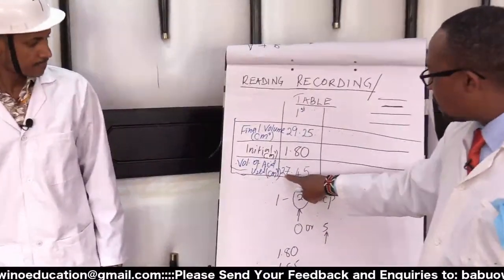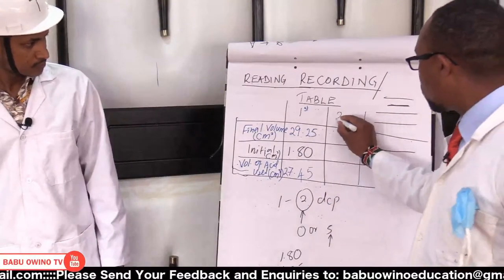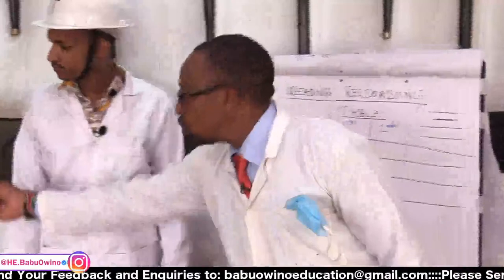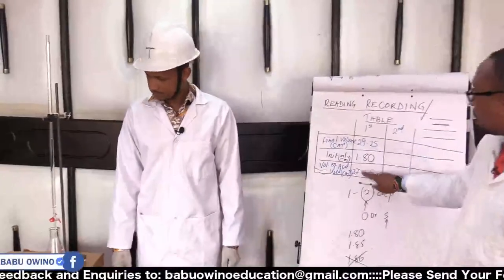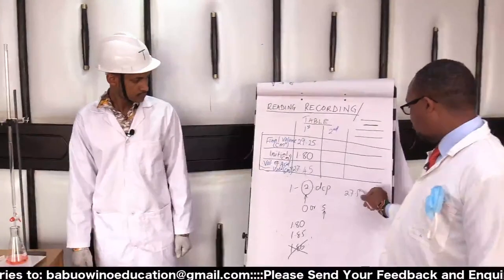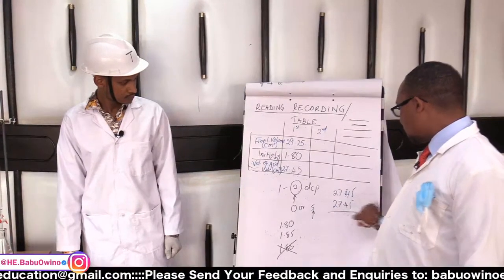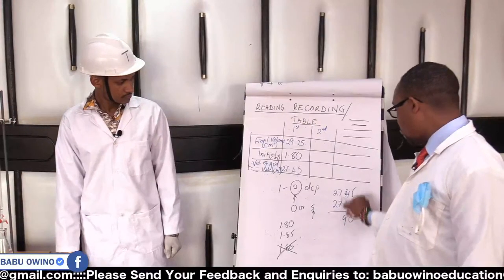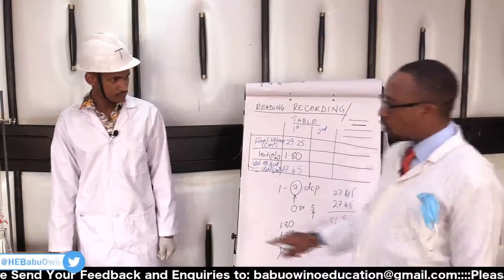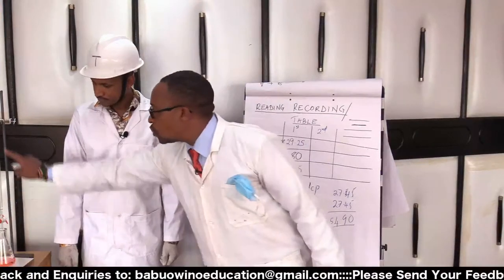27.45. Now, assuming we need to take another titer, that is the second one, there is something you must realize: our burette goes all the way up to 50. So assuming the next one we take is another 27.45, 27.45 plus 27.45 gives us 54.90, and our burette is at 50. So we cannot use this one as our initial.